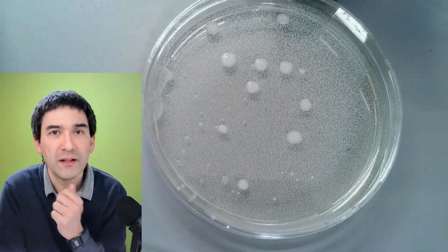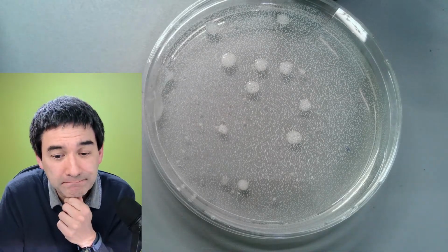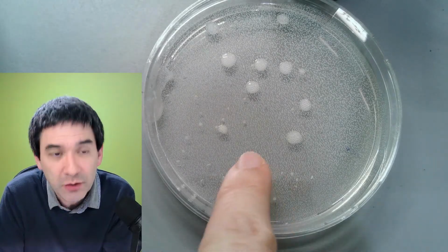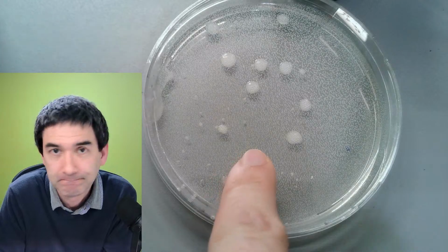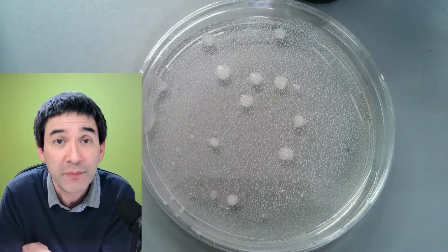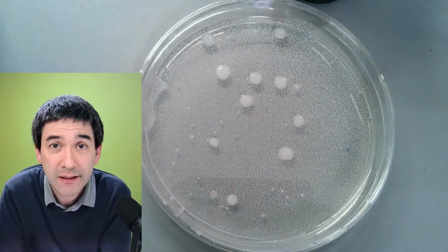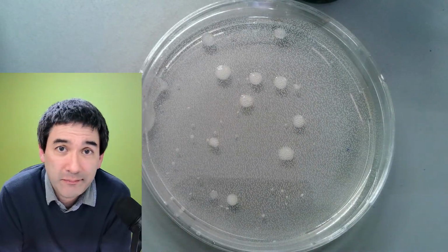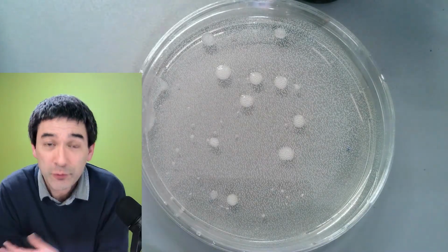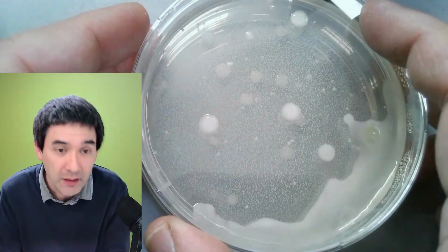So I now need to say the following. Look, folks. Which bacteria are these? I have no idea. I don't know what they are. They're contaminants from the air, or maybe they were already in the yeast extract a little bit. I don't know what they are, right? So I have to be careful, right? And that's simply something where I just want to warn you.